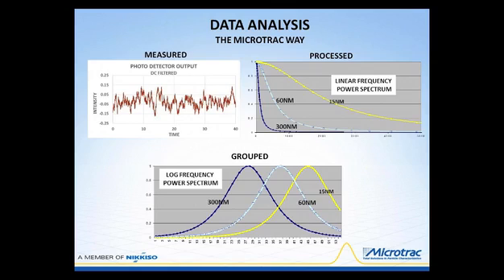In the lower graph, the frequency bucket starts at a small size and then it's progressively increased so that each channel is wider by a factor than the one before it, so that we can compress data that takes tens of thousands of points into data that is shown in here.